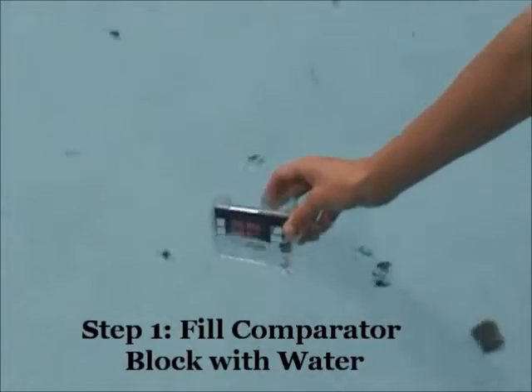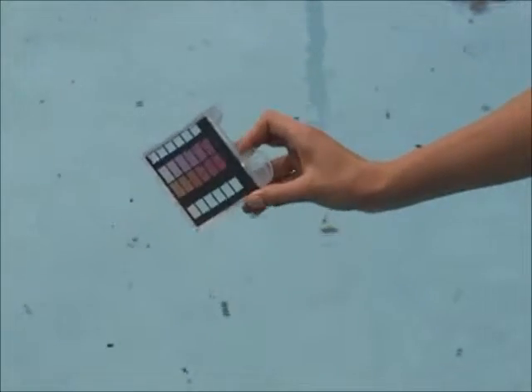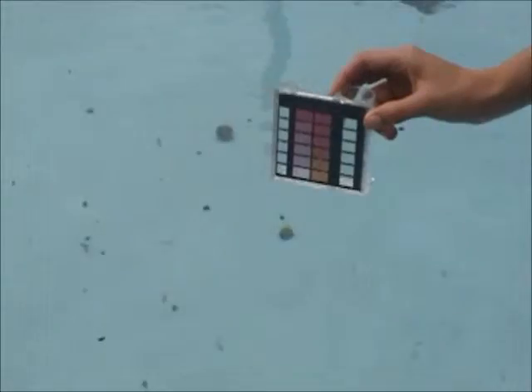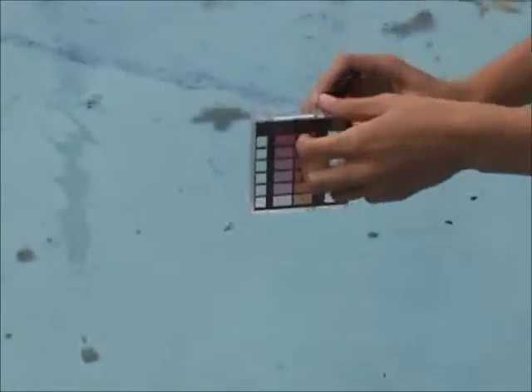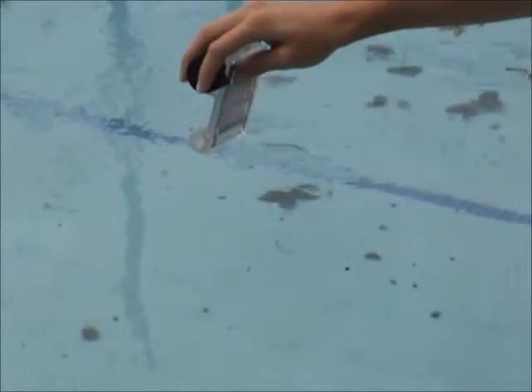Step one in chemical testing is filling the comparator block with water. As you can see, our lifeguard is not using her fingers to sweep out excess water from the comparator block.